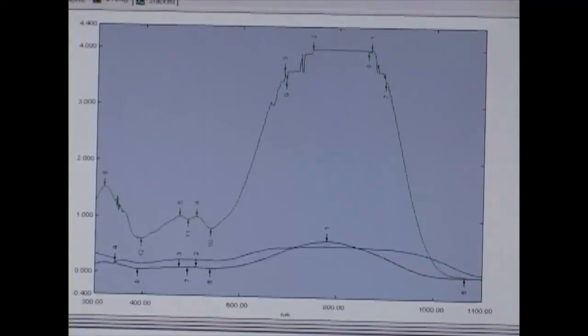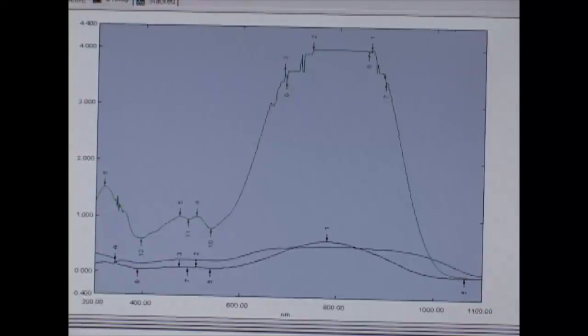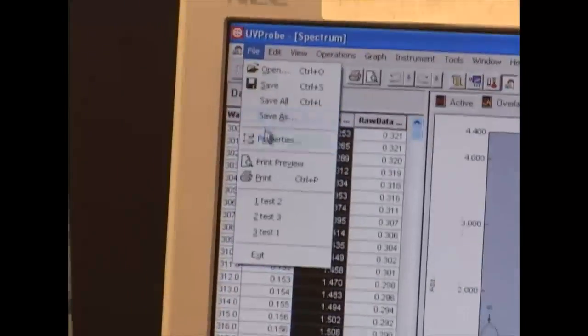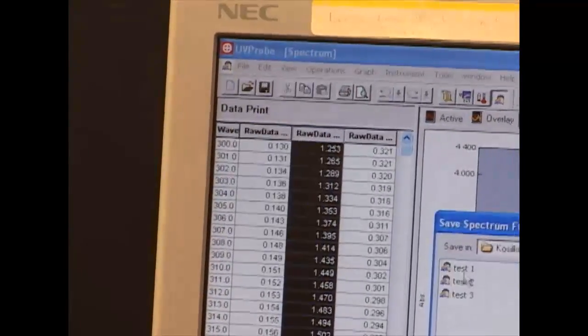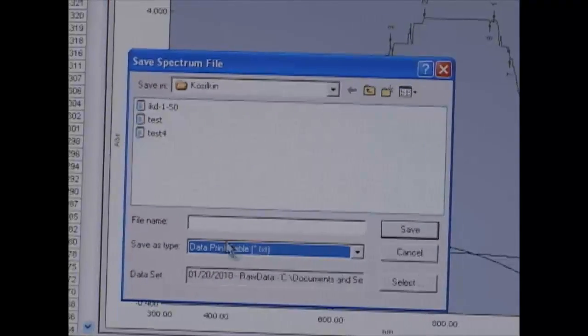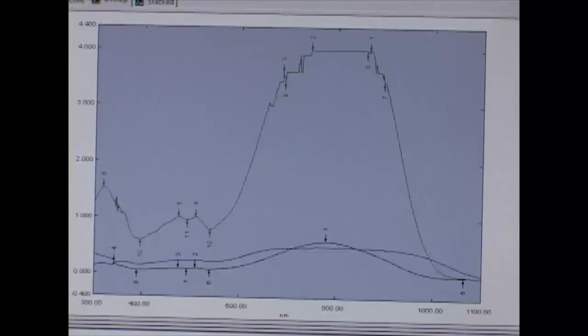Don't forget to save your data. To do that, select the spectrum of interest. For example, this one, go to file, save as, data print table, give it a name, and this is pretty much it.